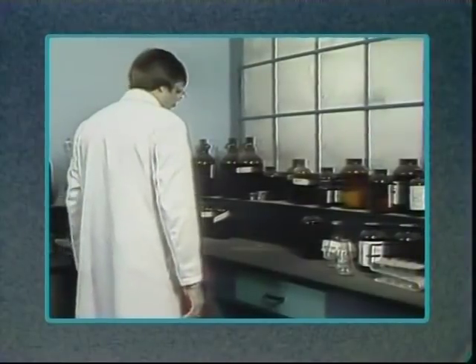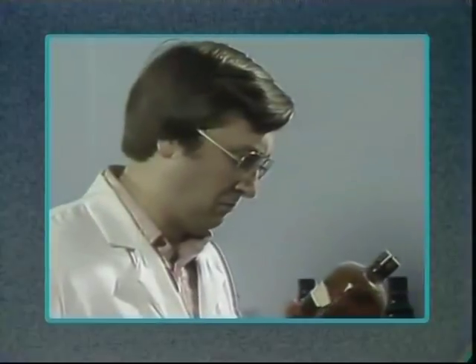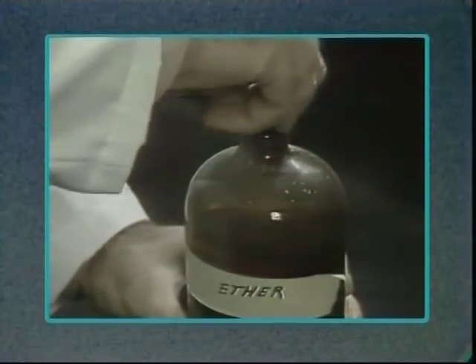Often, fires start in ways that you don't expect. Never use a chemical that you've not been instructed to use. It's possible that the chemical is spontaneously flammable or explosive when it comes in contact with the air. Explosions are fast, and the firestorm they can create can be incredibly intense. Fortunately, most fires that happen in the lab are much smaller. However, the procedure you should follow in case of a fire remains the same.